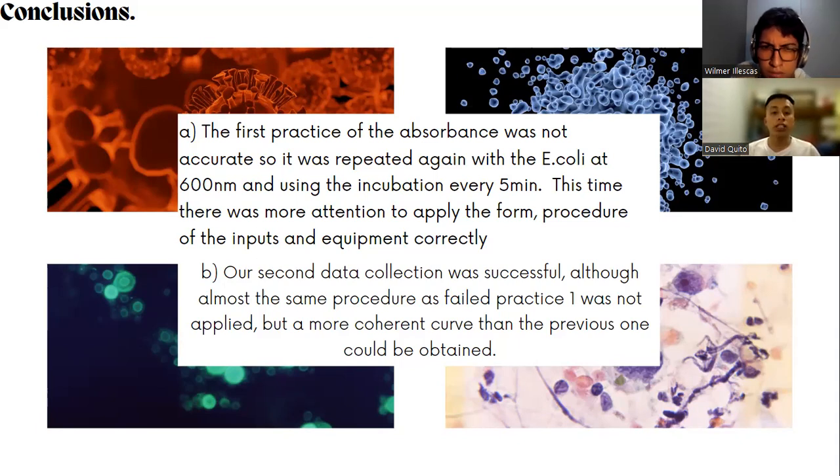And about practice two, our second data collection was successful. Although almost the same procedure as practice one wasn't applied, a more coherent curve than the previous one could be obtained. This is not perfect, but it is very similar to the growth of the E. coli bacteria.